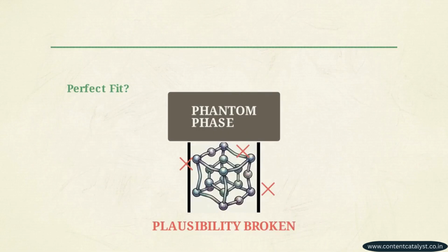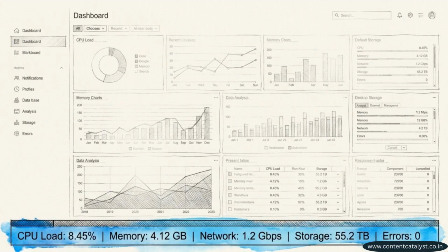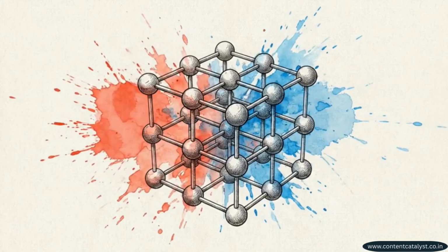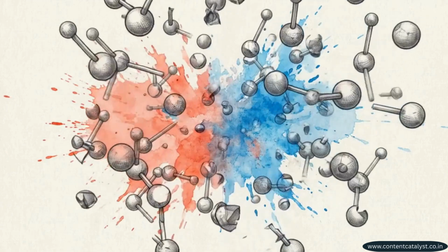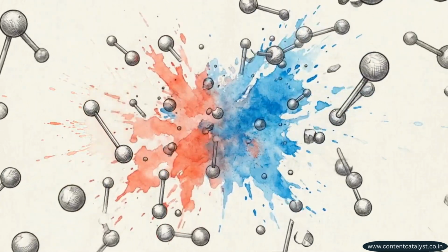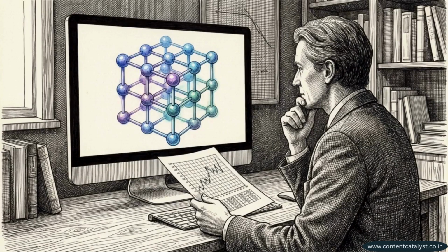A low residual is merely a single input. If the refined parameter values do not make absolute physical sense, the math might be perfect, but the refinement has failed. Analytical software is an instrument. It structures the data and executes the calculations, but it can never replace human scientific judgment.